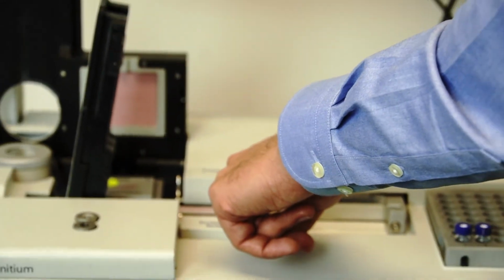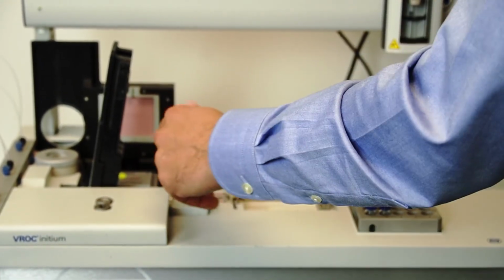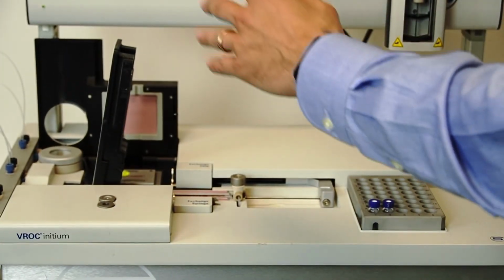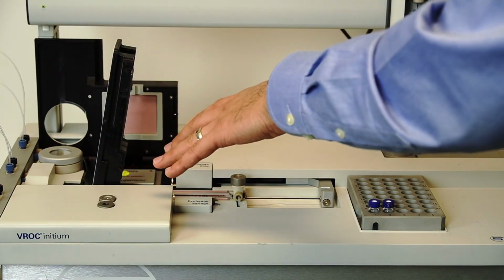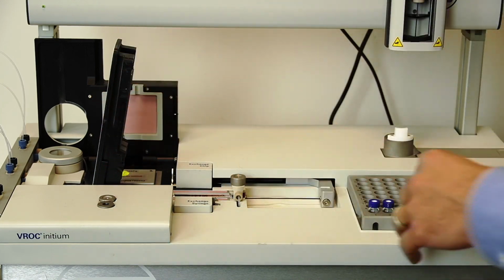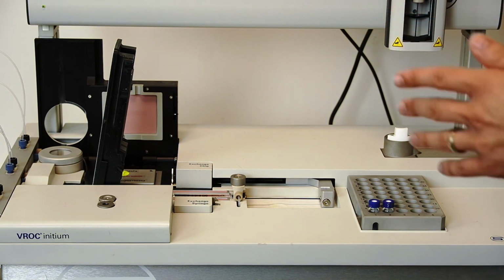So now you can run another test at a different shear rate or what have you, basically on until infinity. And we'll see this later in the test, but it's really important to make sure there are no air leaks in here before you run your measurements, because otherwise you won't be able to use that feature. And this is done before every measurement you perform on the initium.